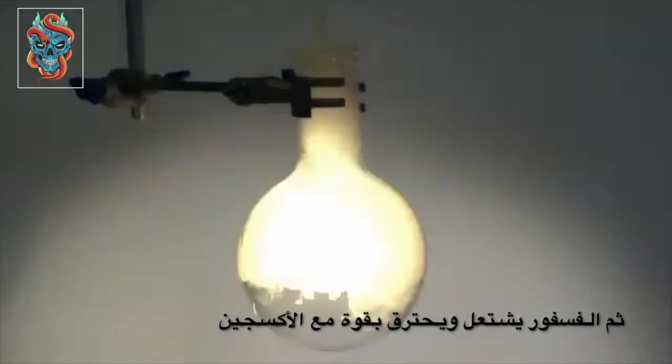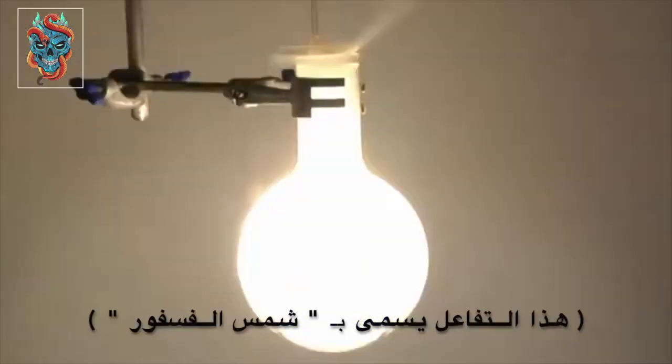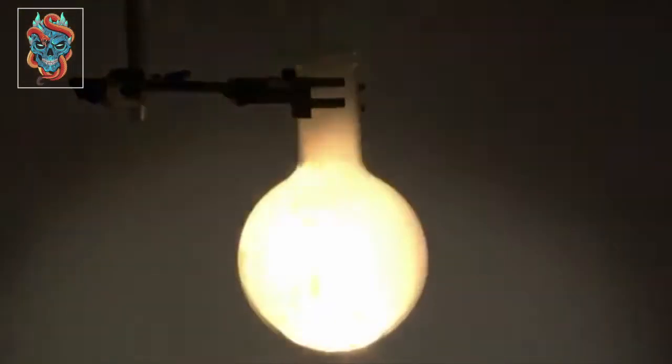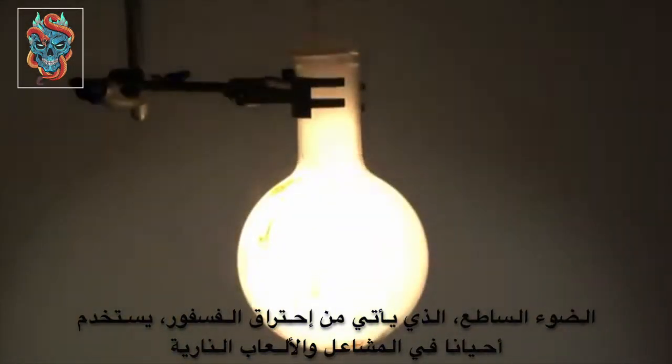It burns vigorously in the oxygen. This reaction is often referred to as the phosphorus Sun. The bright white light that comes from phosphorus burning is sometimes used in flares and other applications.